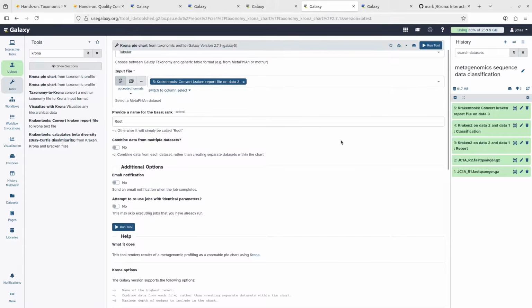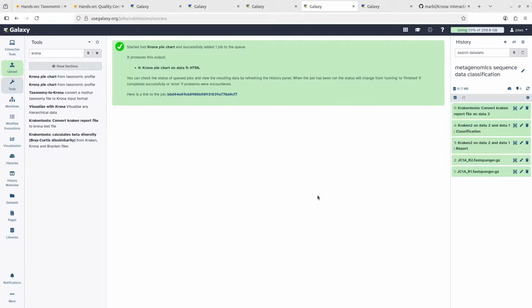Now let's get back to Galaxy. So once I'm done with this, I have root, everything I need is there. I'll just click run to here or here. So I click it and then I'll have to wait for the output to be given. So let's wait for everything to get done for us.